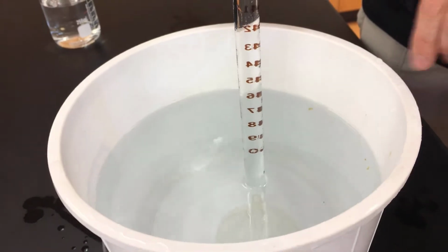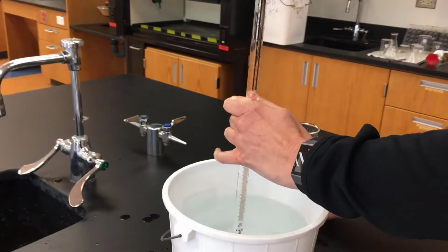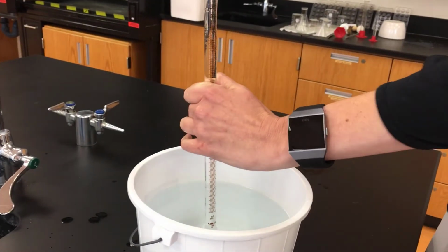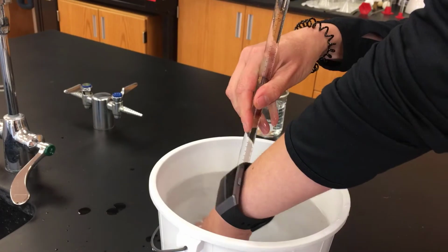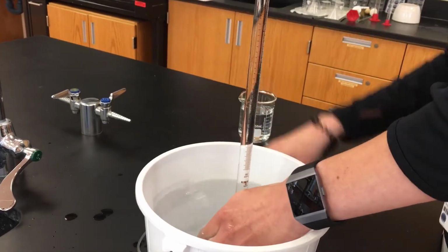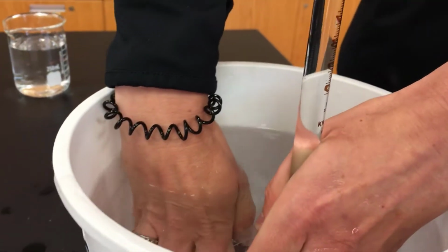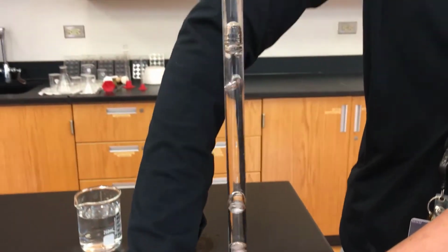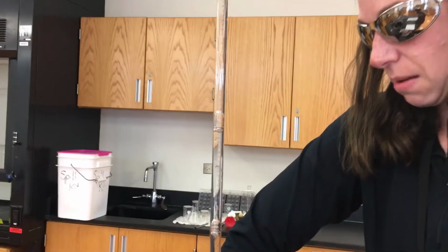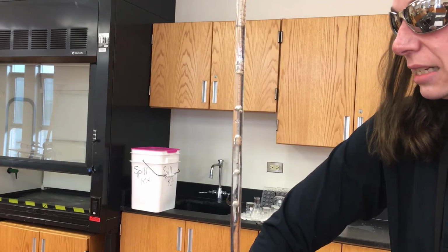Okay. And then I'm not going to actually light the lighter underwater, clearly, but I'm going to push the button so that the butane bubbles out and is collected. If I can get the funnel in one hand. There we go. You can see the bubbles rising, and I'm going to keep them coming until I can get a fairly sizable volume.